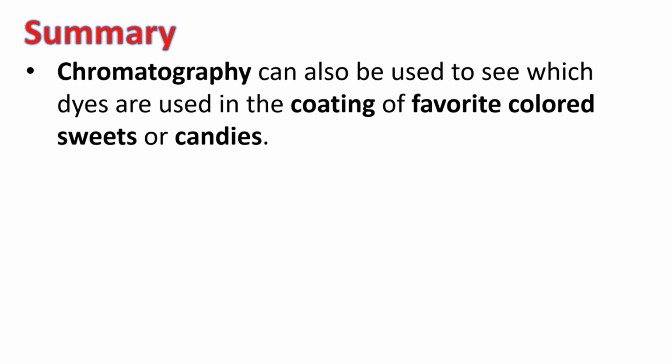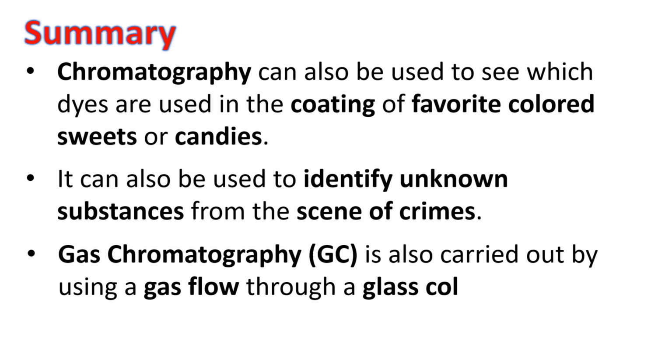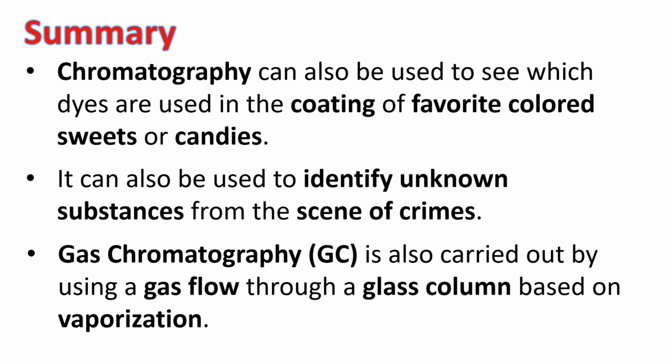Chromatography can also be used to see which dyes are used in the coating of your favorite color sweets or your colored crunchy candies. It can also be used to identify unknown substances from the scene of crimes. Gas chromatography is also carried out by using a gas flow through a glass column based on vaporization. So in this way, chromatography is a useful technique which we use in different fields of life.